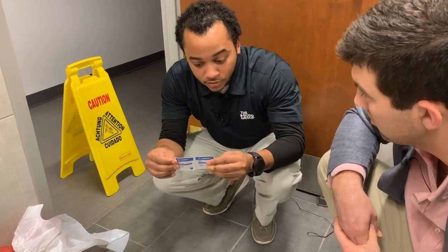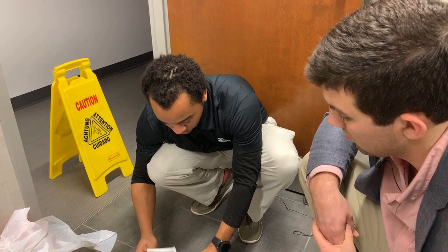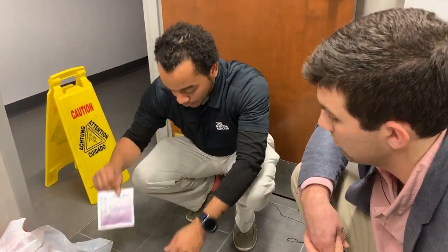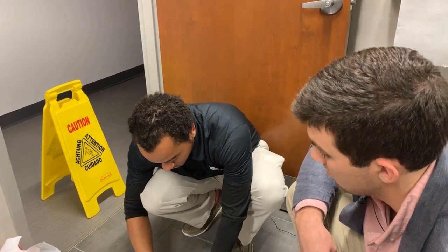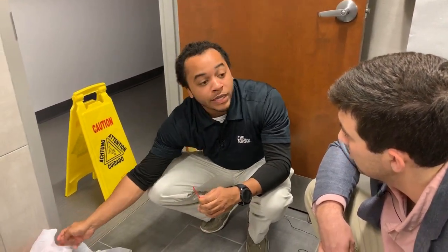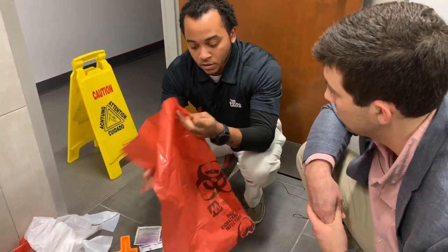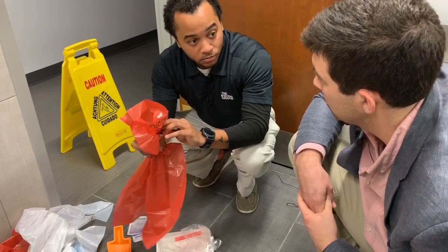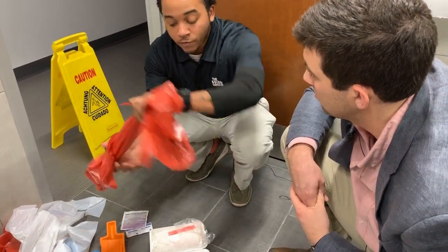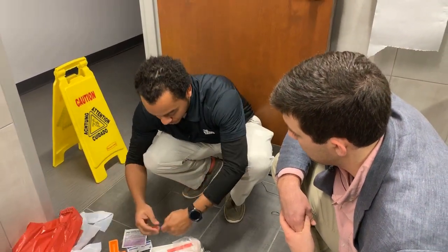Got little towelettes, sanitizing wipes. And also, we have germicidal disposable wipes as well. And we have our little twisty ties that we tie around the bag to make sure there's no leakage coming from here. Okay. So once you're done, everything's in the bag. You tie around the bag, and tie it tight enough so if somebody were to hold it upside down, there's no leakage coming out of the bag. All right. Okay.